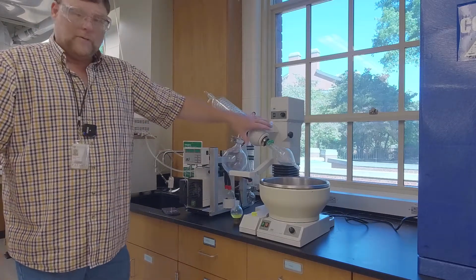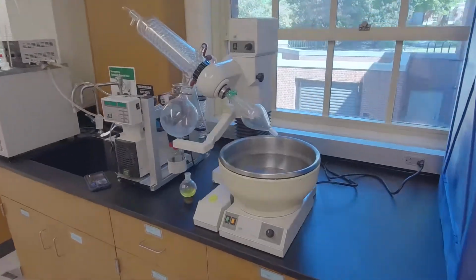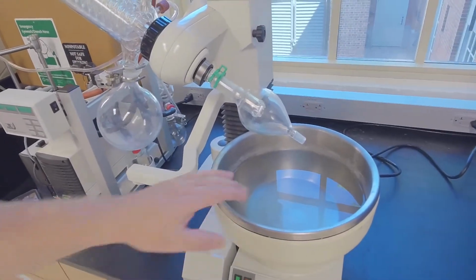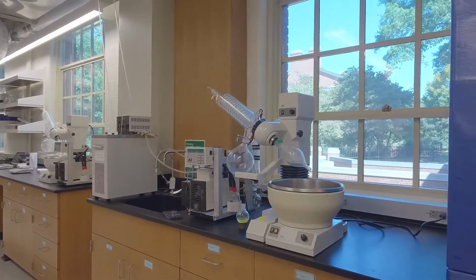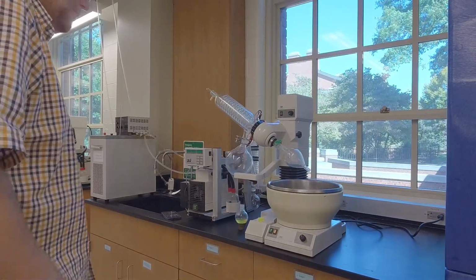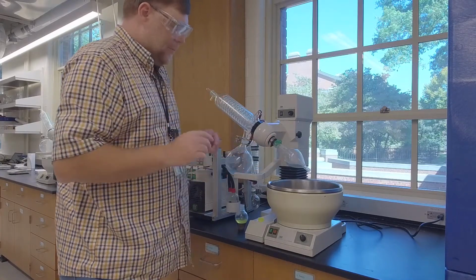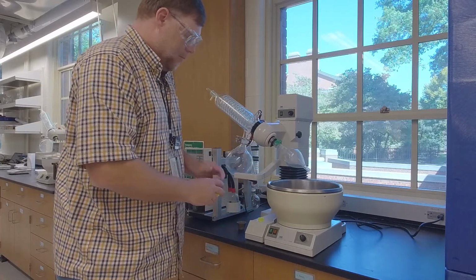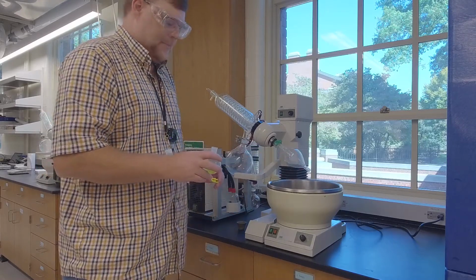This is the rotovap itself. We have a bath of warm water here. Actually, I don't think I've turned the heater on. You don't really need to turn the heater on. The bath is just to replace heat lost by evaporation. Getting ahead of myself. All right. This is what we call a bump trap. That might become important in a minute. We're going to clip the round bottom flask onto this bump trap.